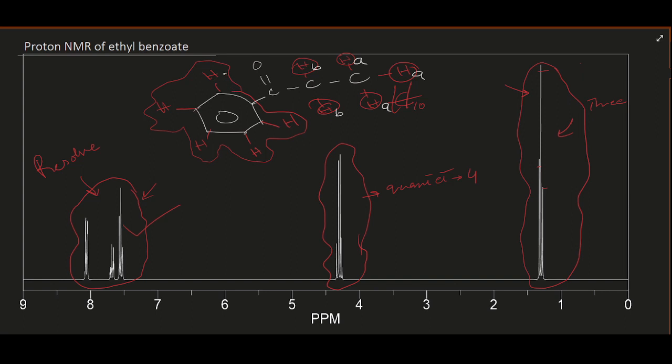This is a proton C. We can give any number or letter identification to these protons, just for ease.